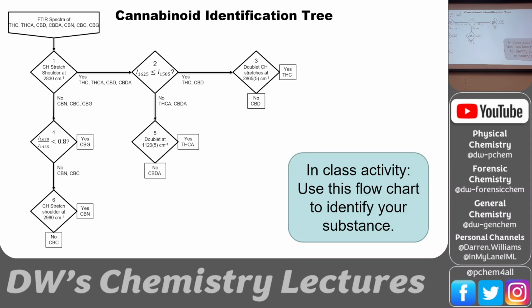So the very first question is the CH stretch shoulder at 2830. Look in the CH stretch region. Do you see a shoulder at 2830? You can answer yes or no, and you can circle 2830. If there's a shoulder there, then you have one of the four compounds. If you say yes, you've got THC, THCA, CBD, or CBDA.